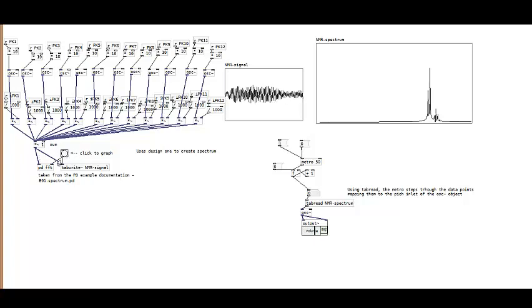NMR, we have to click here to change what's in this array here. We start this again. So now in this one we should get it around here. So we can hear that big swerve here with this curve as that comes in.